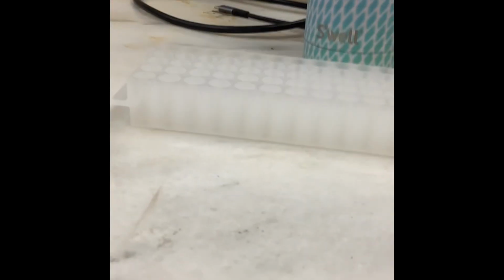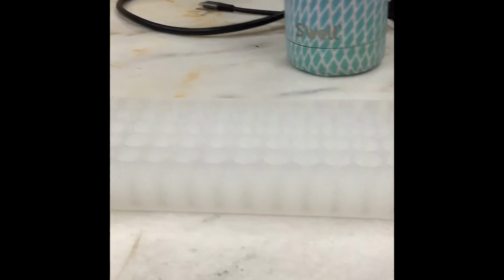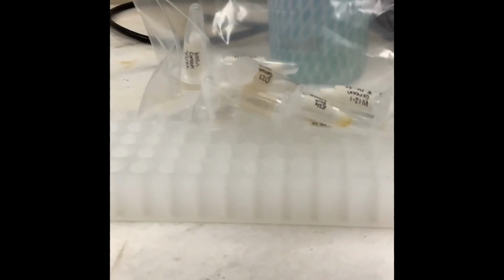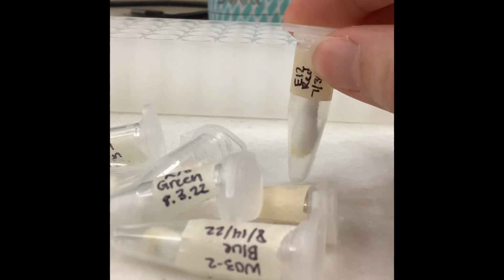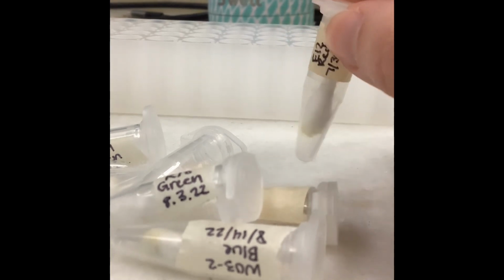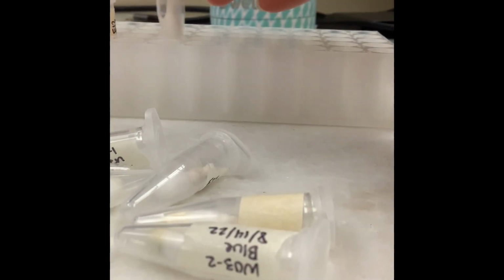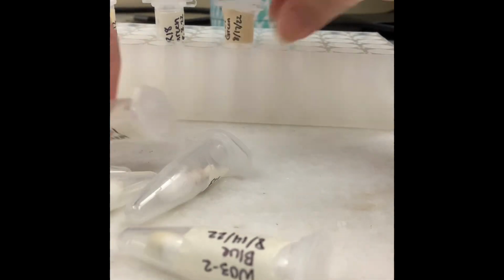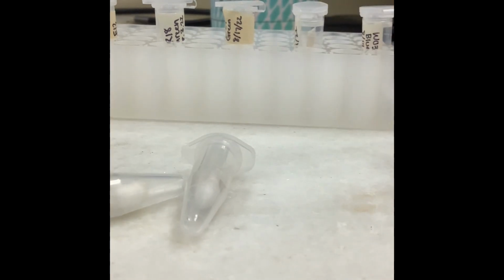So first thing, you are going to need a microcentrifuge tube rack, and then your pollen samples that should be in the freezer. You're going to want to do your pollen samples in multiples of 6, so 6, 12, 18, and so on, because there are only 6 spots in the centrifuge, so that just makes most sense. So for this example, I will do 6, and you're just going to line them up in the rack, and that's the first step. So I have all my samples.